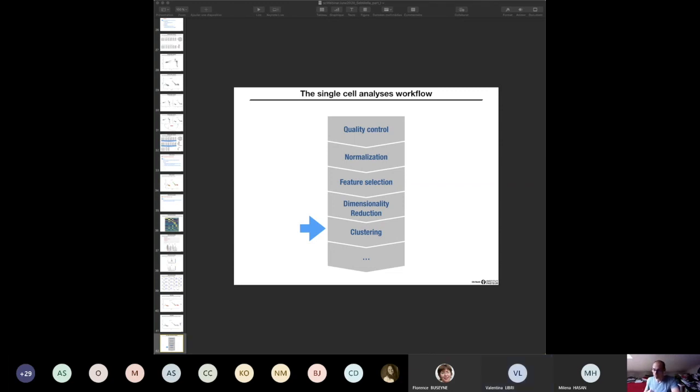So you would need a very strong and powerful computer to do that. And from a biological point of view, when you have a cell type and you compare the number of genes that are going to be transcribed in it to the total number of genes in the genome, it can be a handful of genes, you know.